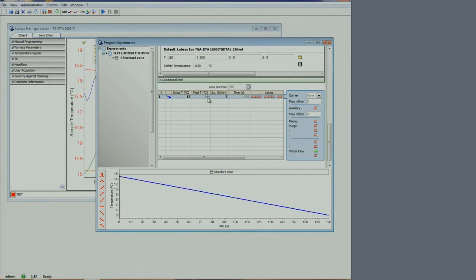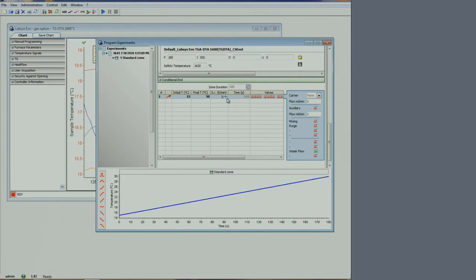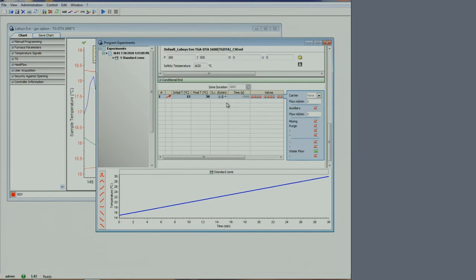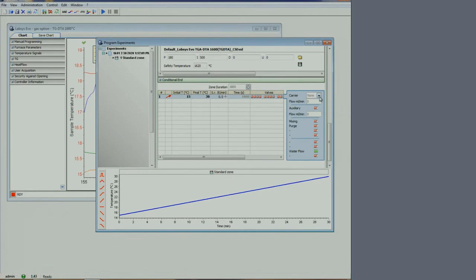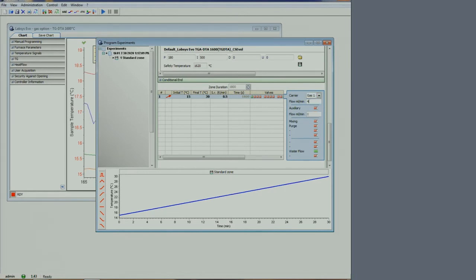Since we are using this as a purge step, this will be a purge of 30 minutes. We select the gas, gas 1 in this case, and set a flow rate of 40 milliliters per minute, which is typical for purging.